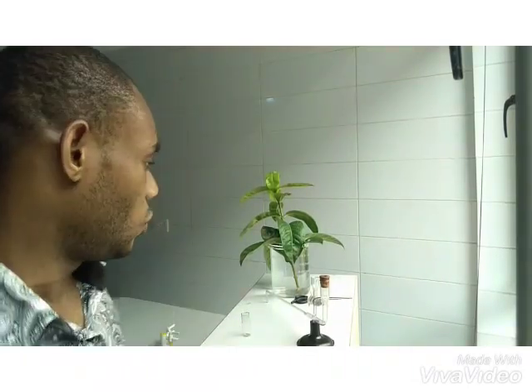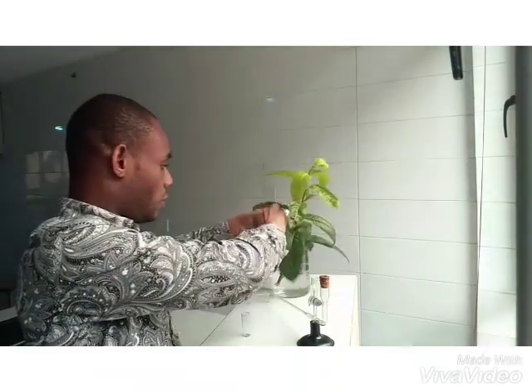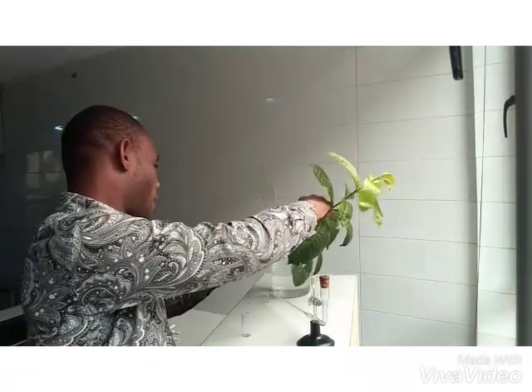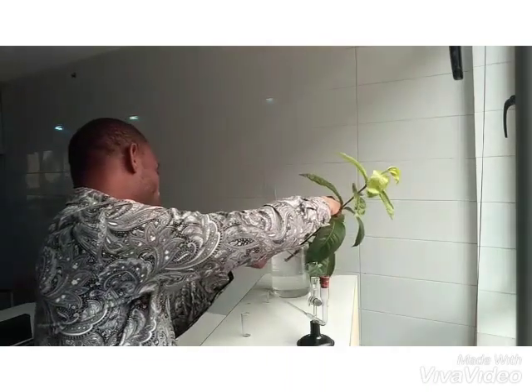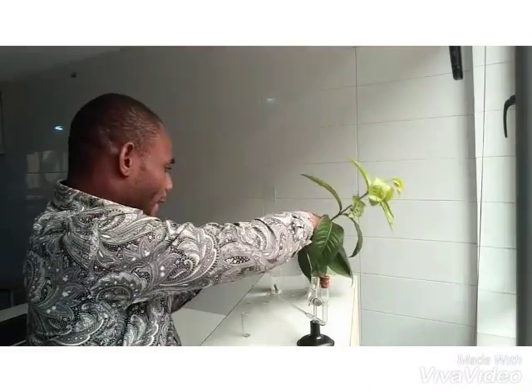Okay, so let's get started with the experiment proper. There are a few steps in this experiment, and the first thing I want to do is to cut my plant under water. So here is my plant. I cut it under water. Okay, I have my plant cut under water.